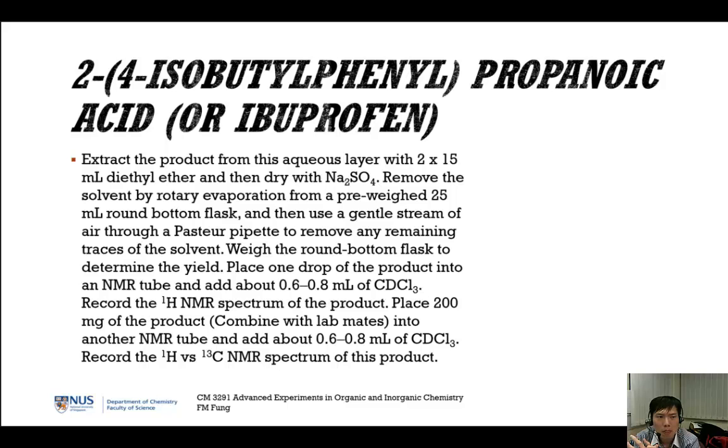Okay. What you can do here alternatively is you can actually connect it into the vacuum pump, but careful, you don't want to remove all your compounds. So slowly turn on the vacuum so that you can vaporize any solvents that's left behind. Okay.